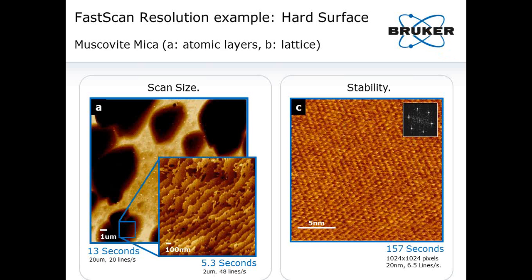The reason for this morphology that can be seen when zooming out like we have done here is that HF doesn't really etch mica well unless there is a local flaw in the lattice. According to the literature, these flaws through multiple atomic layers of mica were caused by natural radioactivity, and their density in mica from different sources is related to local isotope concentrations.